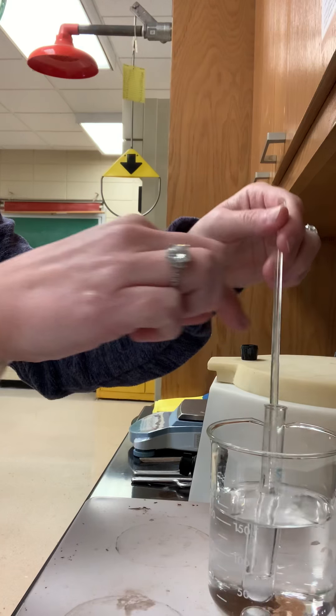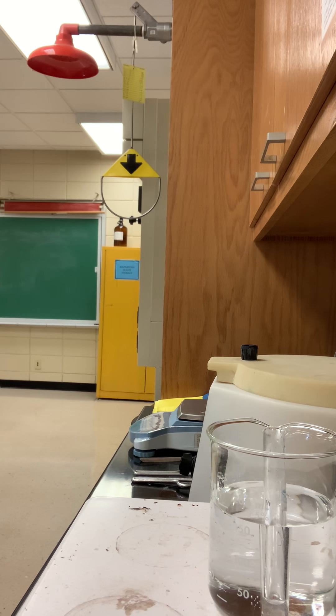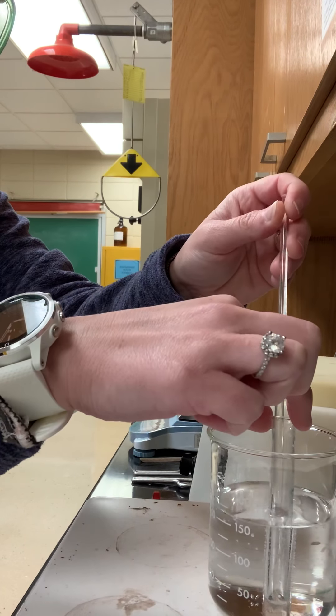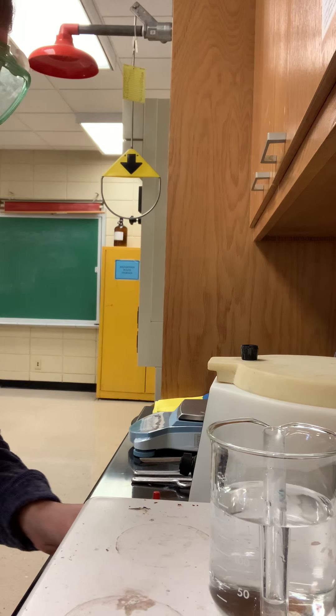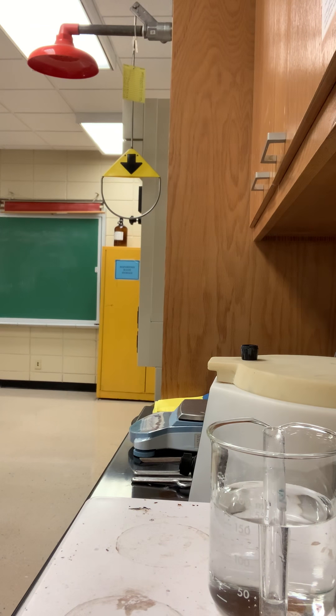It's getting hot on my fingers. We're getting closer — we definitely need to make sure we give it the full three minutes. While I'm waiting in between my stirrings, I went and got my sulfuric acid, which I'm going to be needing.